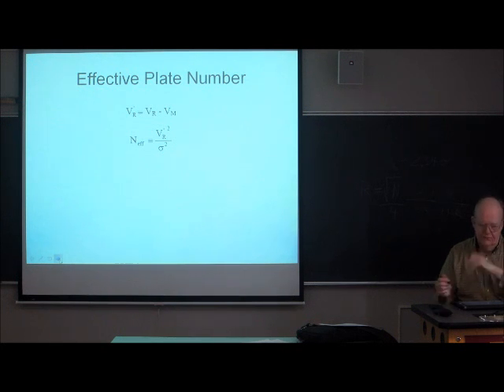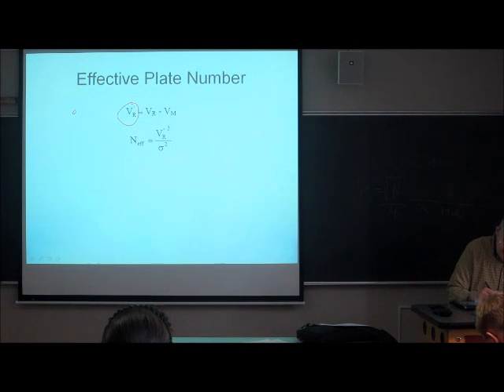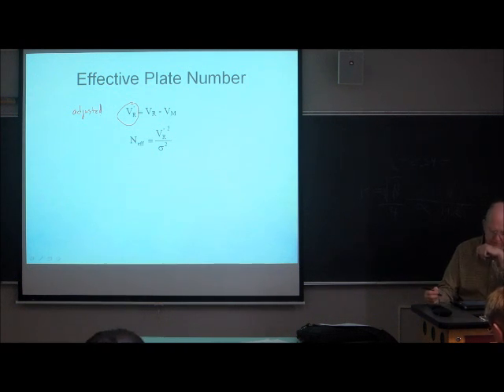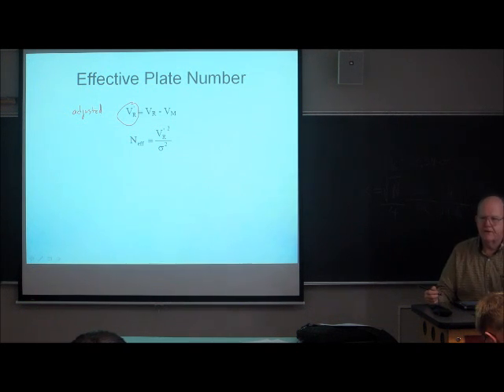So what they do is use a volume or time known as the adjusted retention volume, by subtracting the dead volume or the dead time from the retention volume or retention time. And then they calculate the plate count.